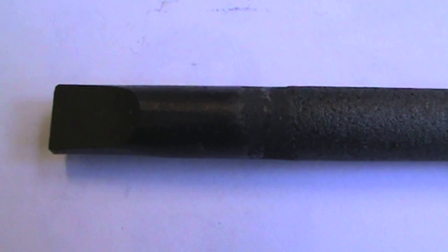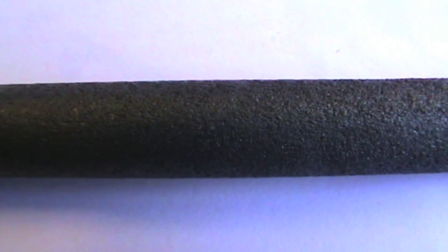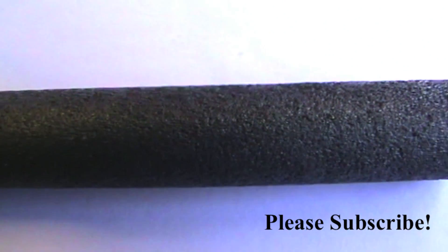There we have it, TDC viewers. We have successfully deposited lead dioxide onto graphite under the influence of a cationic surfactant under stationary conditions.